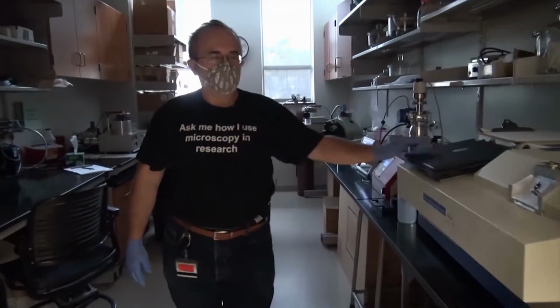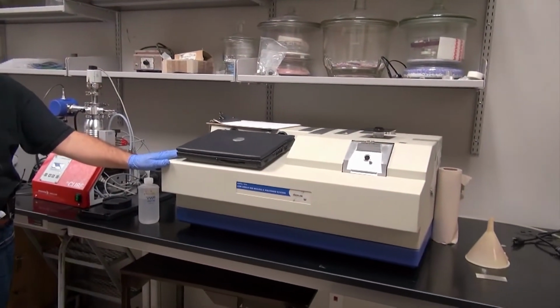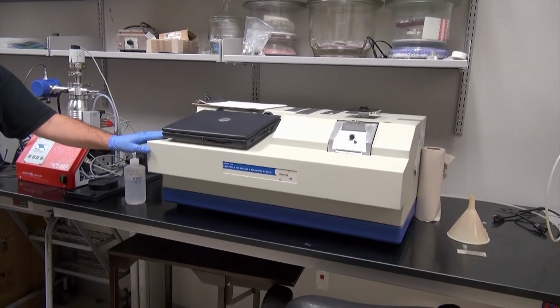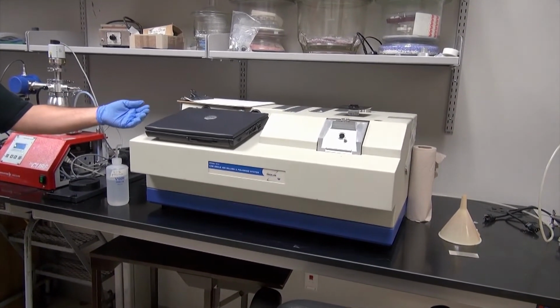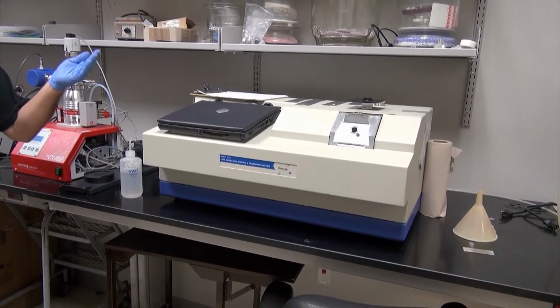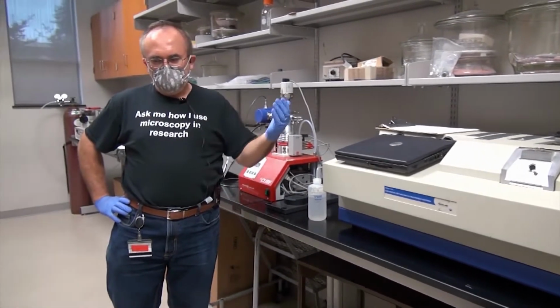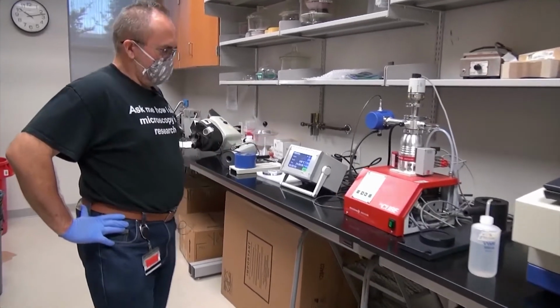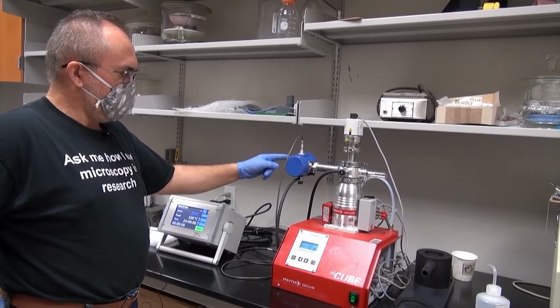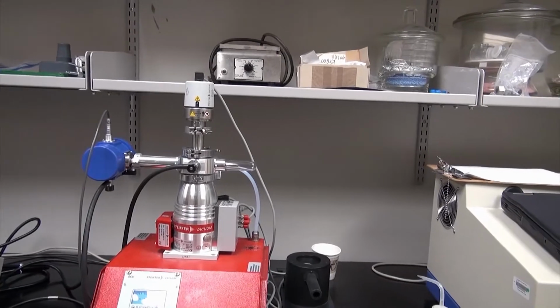Continuing in the sample preparation theme, we have the Fischione ion mill, and this machine is used to thin materials before they can be put in the transmission electron microscope to sufficient thinness. And this is our second pumping station that's currently holding our newer cryo TEM holder, the Fischione holder.